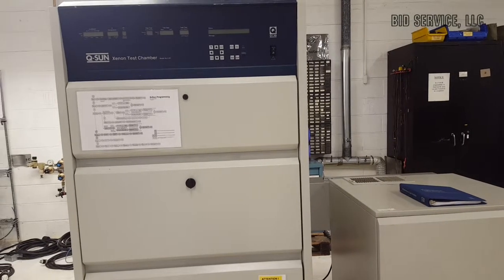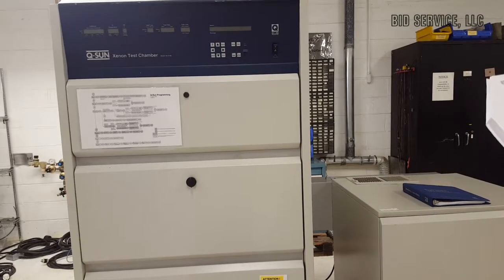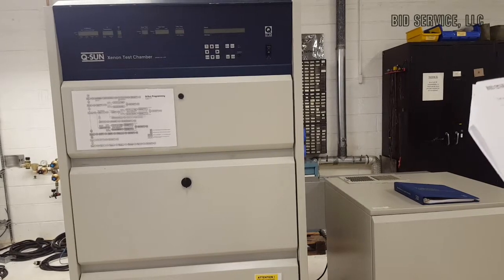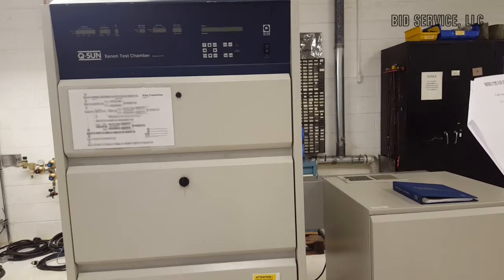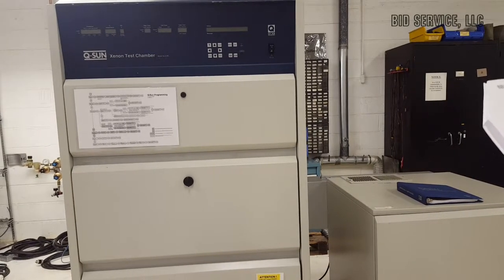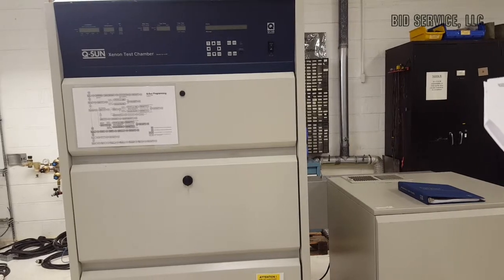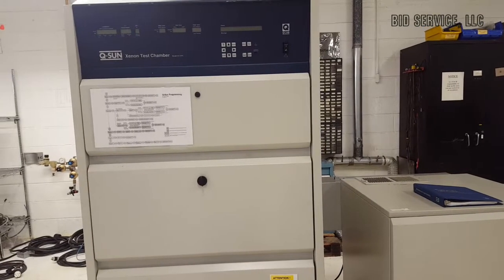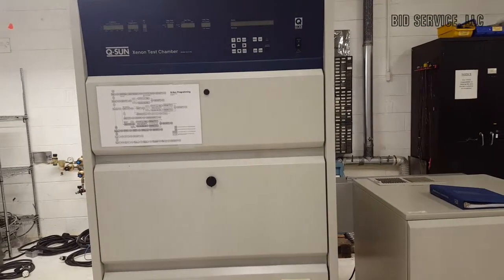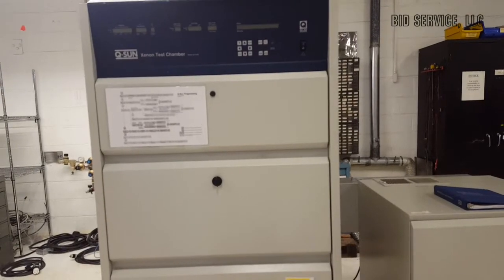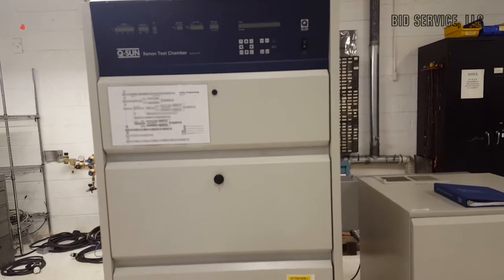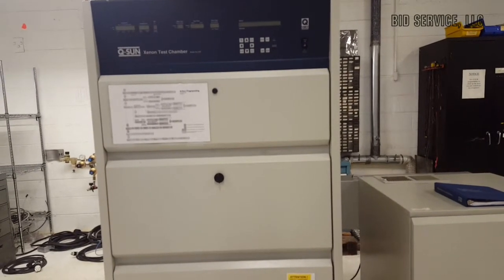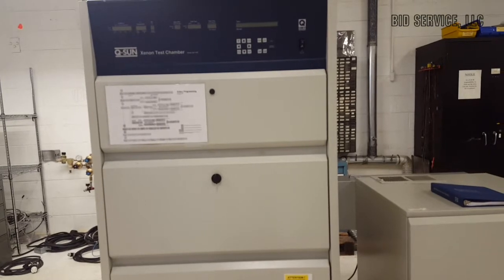It simulates and accelerates various conditions, provides the best match to the full spectrum of sunlight, controlled humidity for realistic moisture simulation, automatic, and can be operated 24 hours a day, 7 days a week.